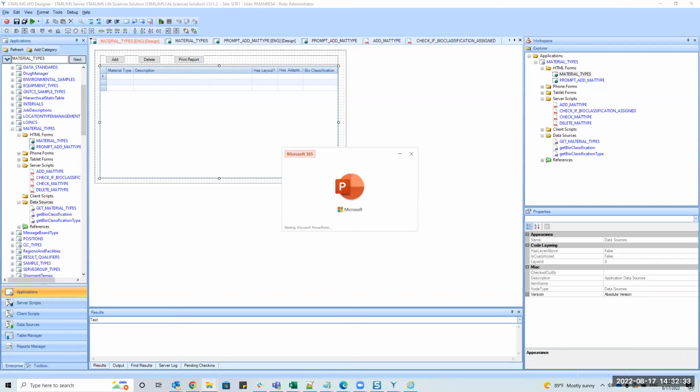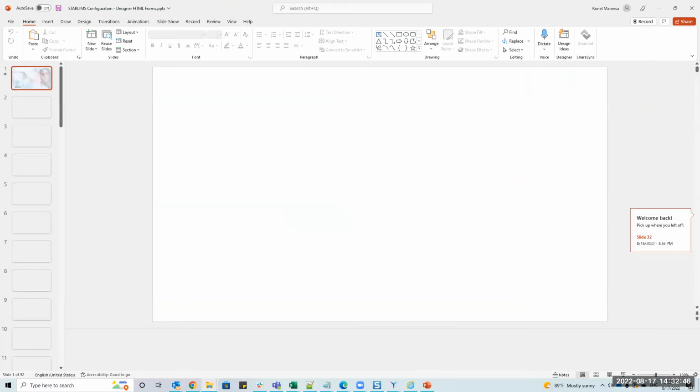Anybody? It needs to be interactive. I don't want to just sit and talk for 2 hours. Yeah, I think David touched on all of those. This was a little more in depth than what David got into. Okay, good to know. I think we're all set up going into this.